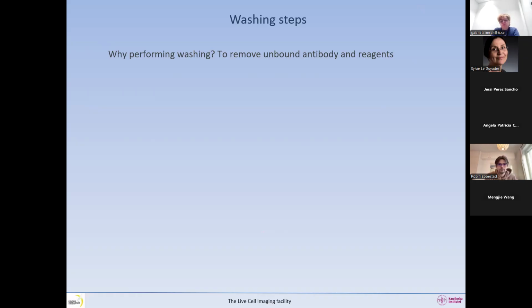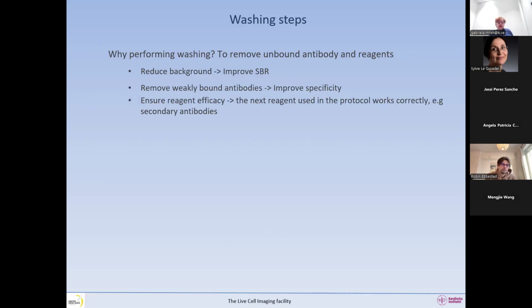The primary goal is to remove unbound antibody and reagents, and by that it will reduce your background. So it will improve your signal to background ratio, and remove weakly bound antibodies to improve the specificity.